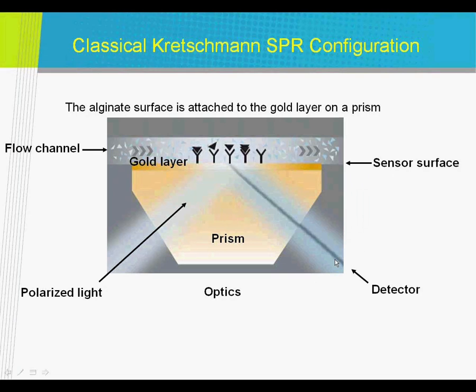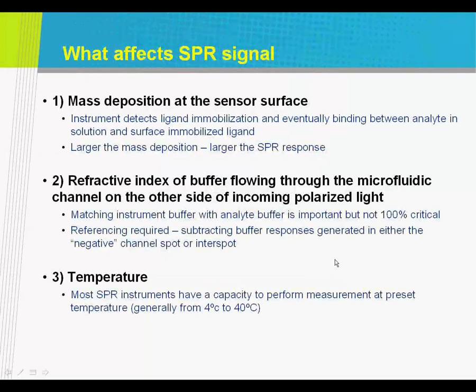So now the cornerstone of all instruments, and especially in this case ProteOn, is the fluidics and the cleverness of the fluidics. And I'll just address the fluidics of the ProteOn, how it works. In ProteOn, you can have up to 6 channels on your chip, and you can immobilize up to 6 different ligands using classic NHS EDC chemistry. So you could immobilize 6 different ones.